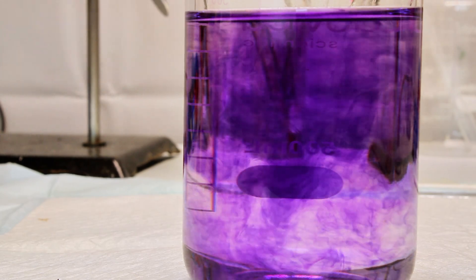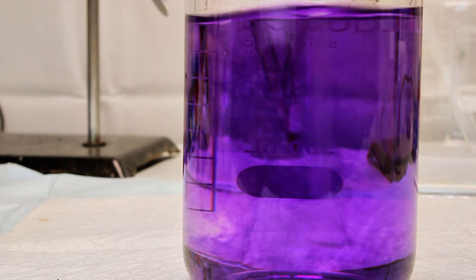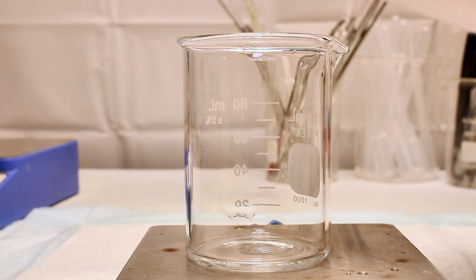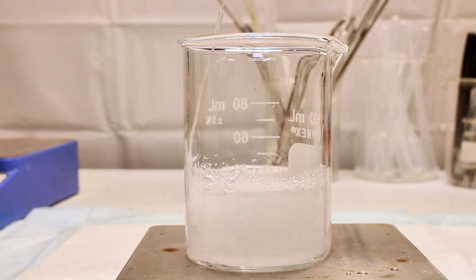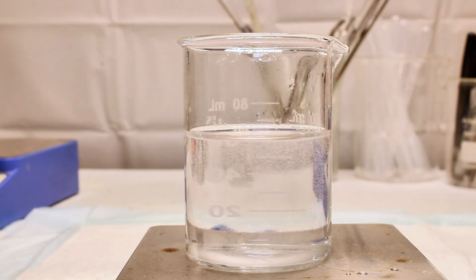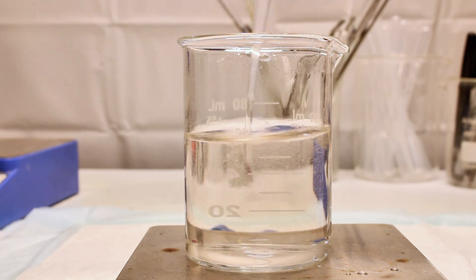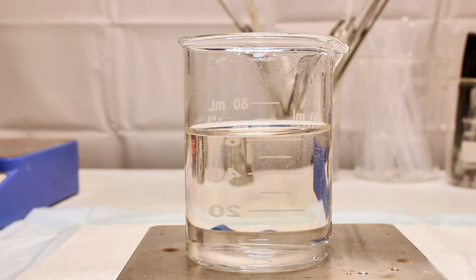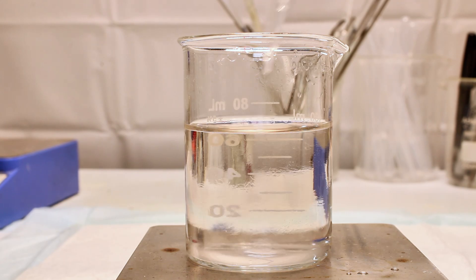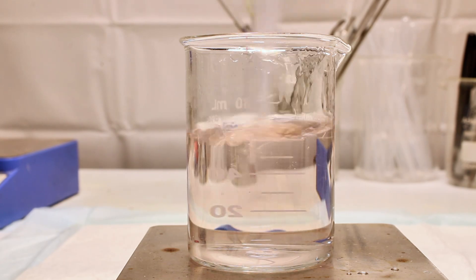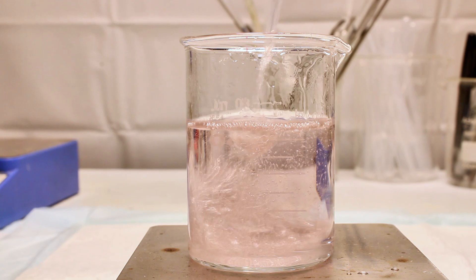To demonstrate the ketone test, I simply added a few milliliters of the nitroprusside solution to some acetone. And I wasn't really sure if this would work, but I figured acetone is a ketone, so why not? This reaction wasn't nearly as dramatic as the sulfide test, but after a minute or so, it did become a faint purple, which became slowly darker over time.